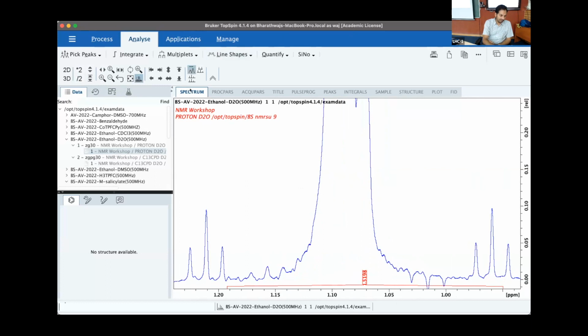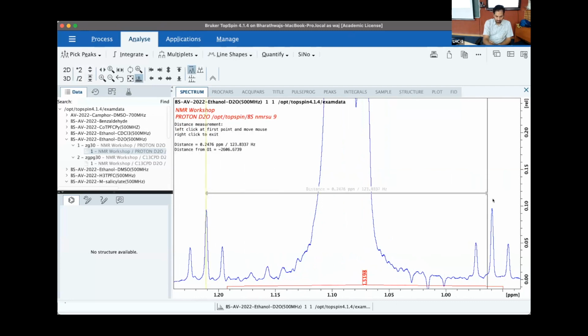Why are they coming? Let's measure the proton-carbon coupling that we take here. So here, it comes up to 125 Hertz. This is a very typical one-bond proton-carbon scalar coupling. Okay? So we have been talking about satellite peaks. Why do satellite peaks come up? Because you still have 1% natural abundance of carbon where the proton gets split by this. You can always decouple carbon here, but that's kind of unnecessary. Okay? So this is one point that we read in this.